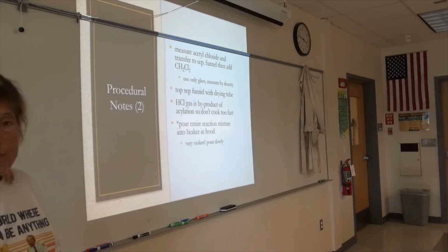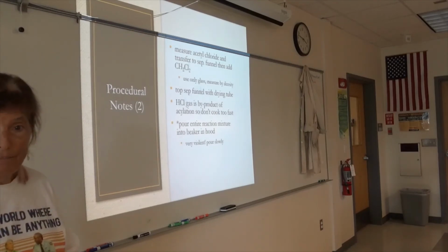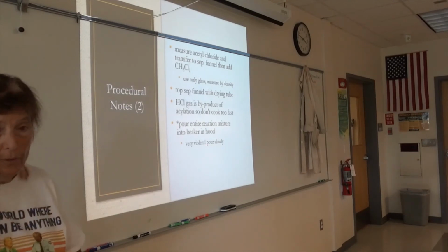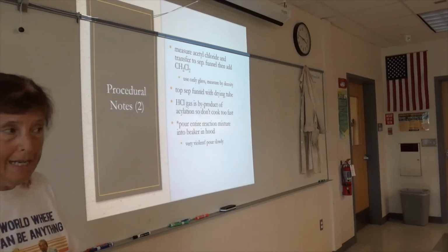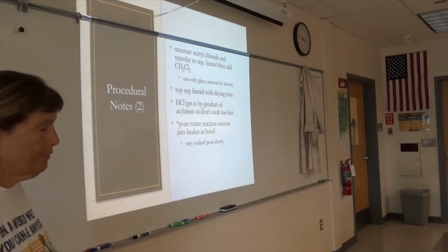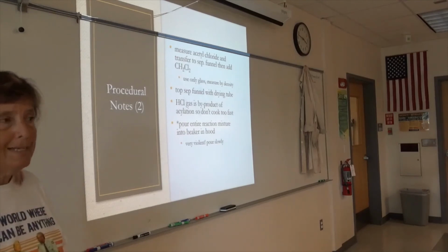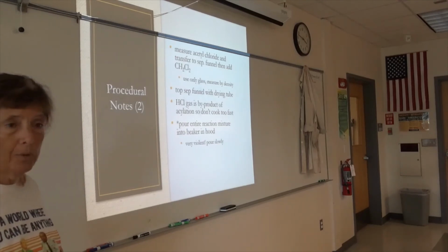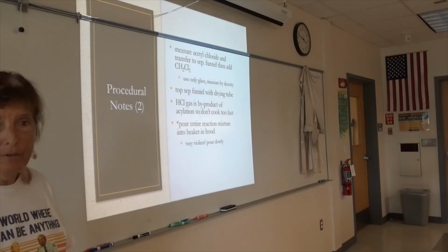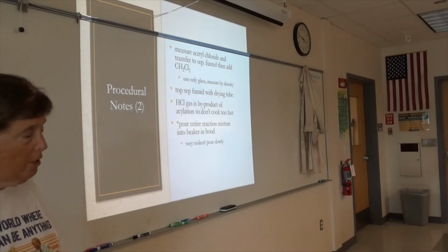Notice the asterisk here. The rest of this will be done the following week. So you're going to stopper your 3-neck flask well. Make sure each of the stoppers is well greased. If we need extra Teflon stoppers, etc., we've got them. Leave them in your drawer. Next week, we're going to start by pouring the reaction mixture into some HCl. That is a very violent reaction. We're going to want to do it in the hoods, and you're going to want to pour very slowly.